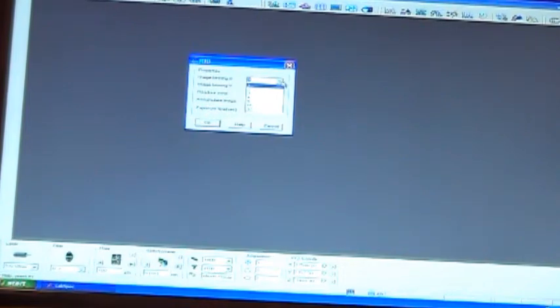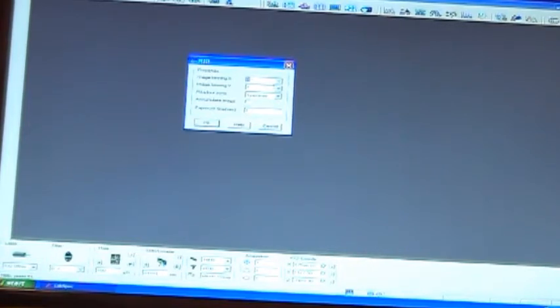Times, which is really horrible resolution, but you will get map data really, really fast. We always leave these set to 1. It's up to you guys to change them. We leave it set to 1 for the best resolution.